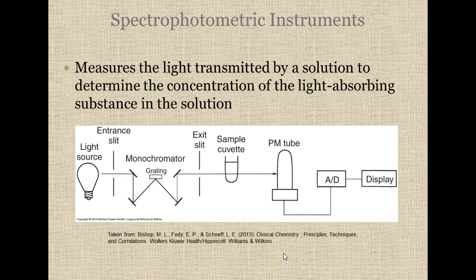I have all of the parts listed here of the spectrophotometer that you are going to be using in the clinical chemistry laboratory. This measures the light transmitted by a solution to determine the concentration of the light absorbing substance. Let me give you an example.